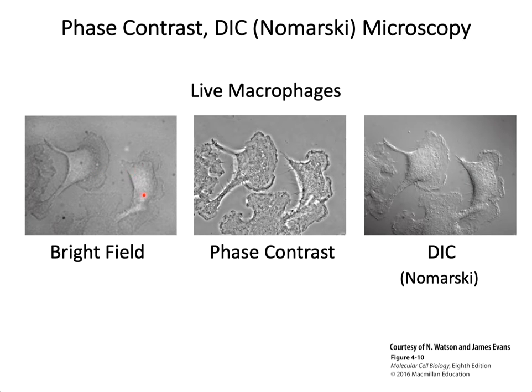The vesicles have a different refractive index, the Golgi apparatus, etc. So phase contrast microscopy takes advantage of these differences when the light is projected onto the sample through a series of annular rings. Depending on the refractive index of the intracellular components, it will push the light out of phase or keep the light in phase. Light out of phase is dark and light in phase appears very light. So the result is you can see more details inside the cell.